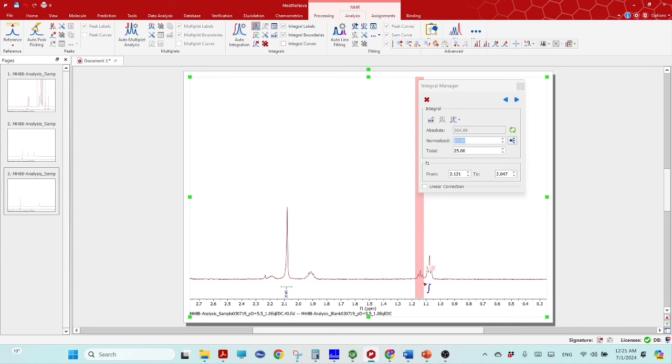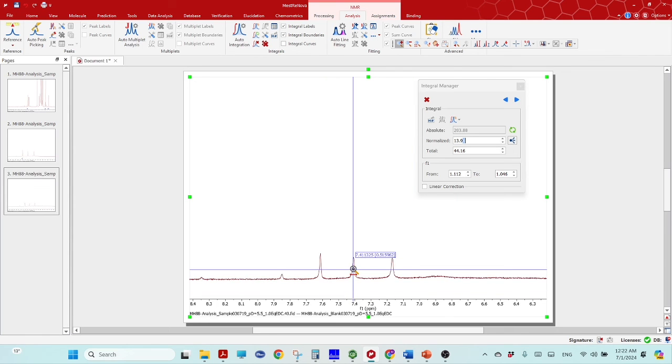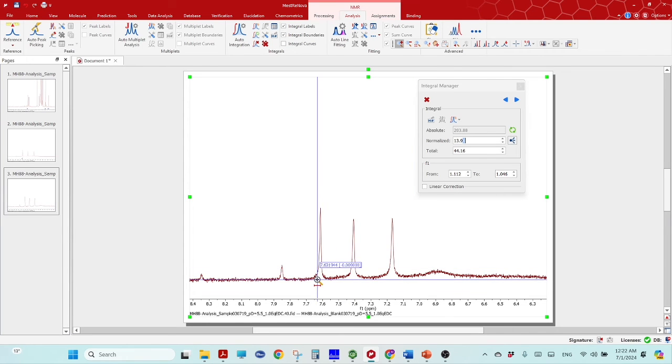EDC and urea. So EDC consumed, and the concentration of the EDC originally was 25 millimolar, but it is now 5 millimolar, and urea is like 13.86 millimolar. Monitoring how much pure EDC is there and how much final product urea is forming here, and also in the acid region how much acid is there.